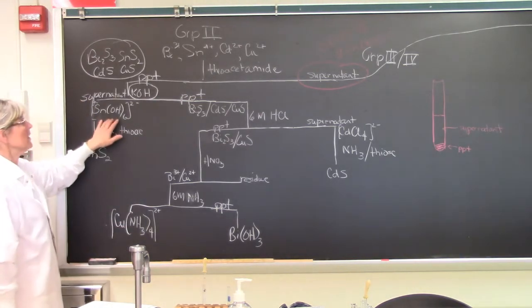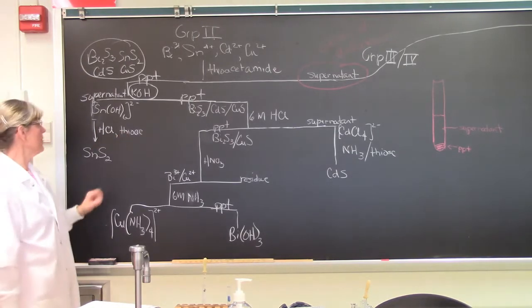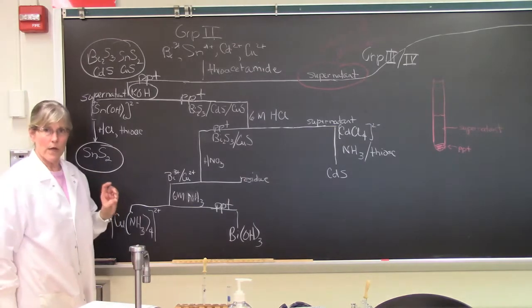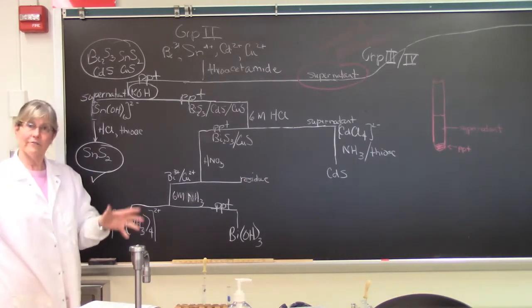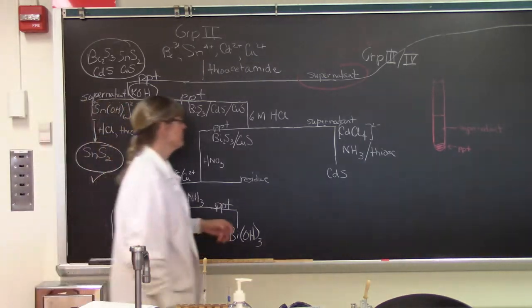And then we're going to take that pellet and add some hydrochloric acid and some more thioacetamide to return it to this murky yellow tin sulfide. And that is our affirming test, or confirming test, for tin.